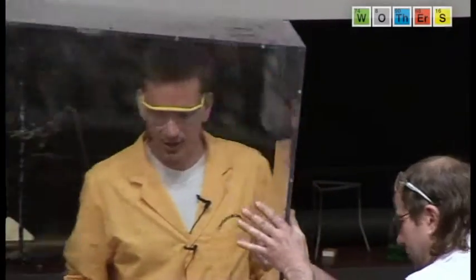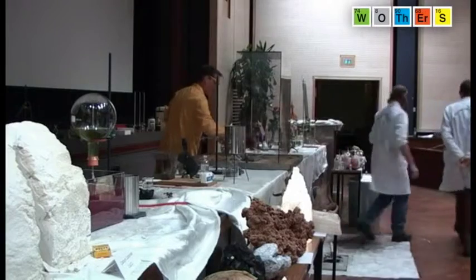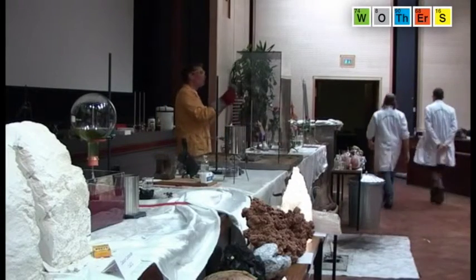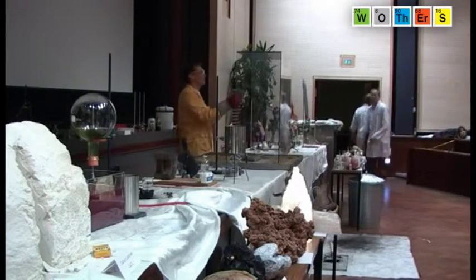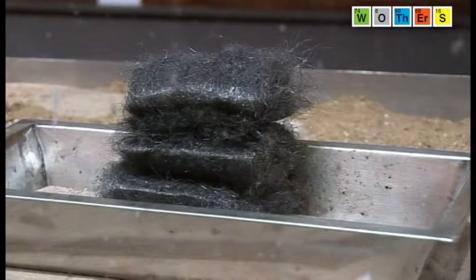In case you didn't quite see the sparks, we're going to show you another version. Here is some iron wool — the sort of thing you might use to clean your pots and pans. We put the iron wool in there and add some concentrated oxygen — this is liquid oxygen.